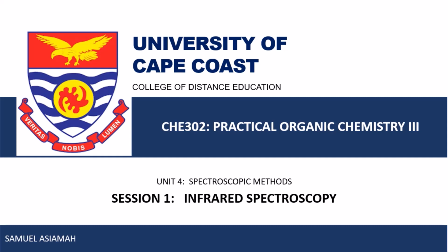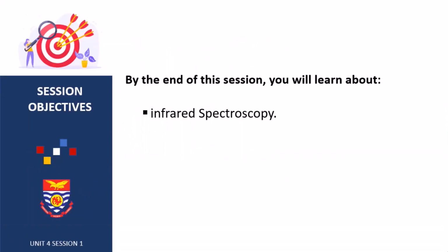is on spectroscopic methods. Now, in Unit 4, today being our first meeting, we will look at the first session under Unit 4, which is on infrared spectroscopy. At the end of the session, you are going to learn more about infrared spectroscopy.